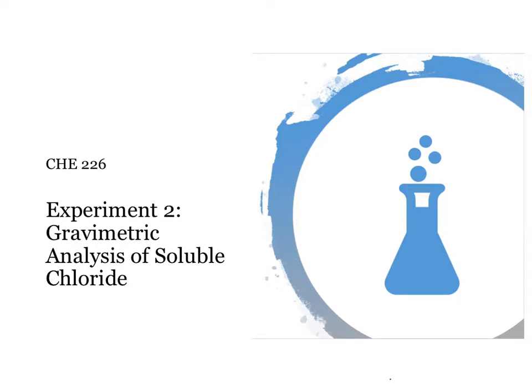The next few weeks, we'll be using gravimetric analysis to determine the percent of chloride in an unknown sample. In this short pre-lab lecture, we will first clarify what gravimetric analysis is, summarize the procedure for Experiment 2, and discuss what is needed for the worksheet due after lab.